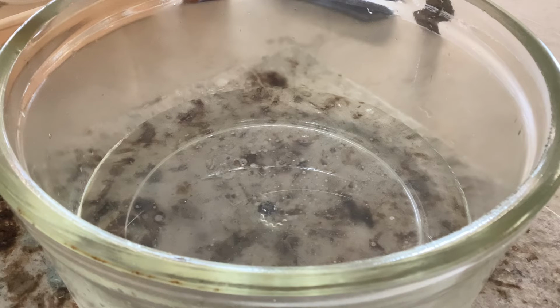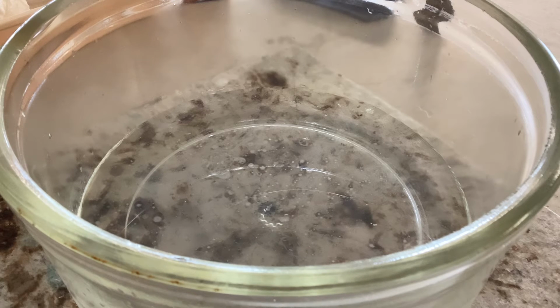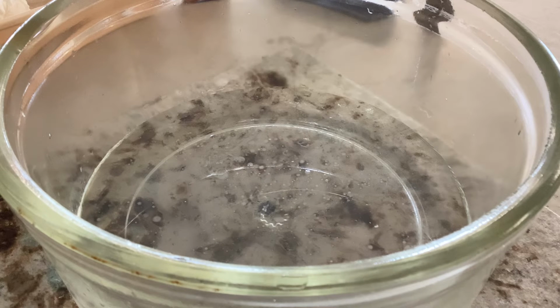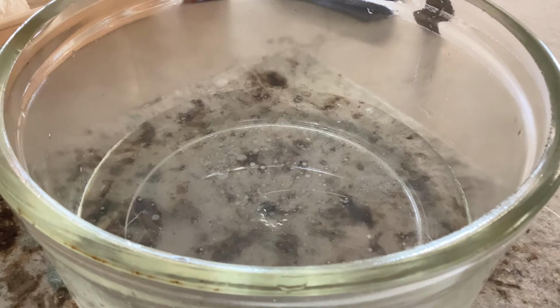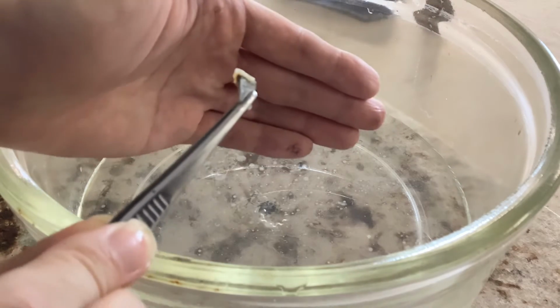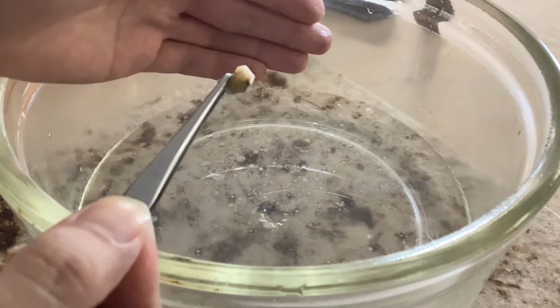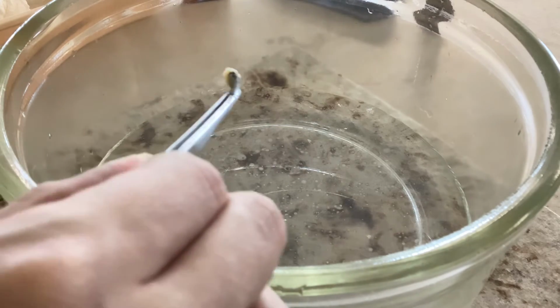metal inside the paraffin oil, called potassium. And again, just a similar procedure. Take it out with a pair of forceps and then use a tissue paper to remove the oil on the top. This is how this potassium looks, somewhat gray in color with a not very shiny surface. And let's observe.